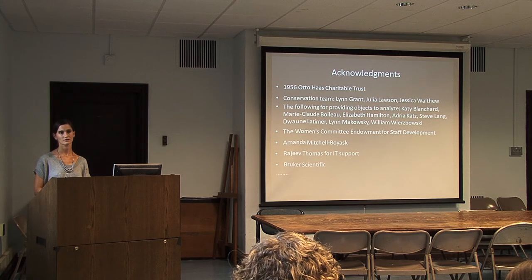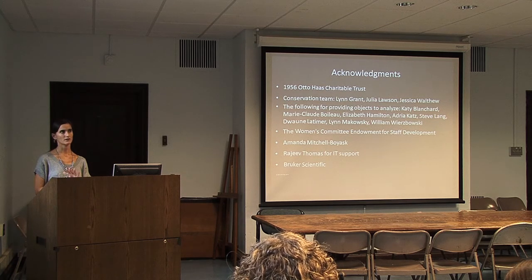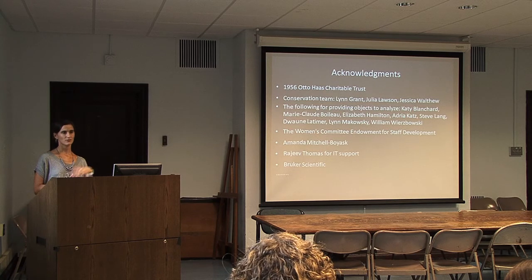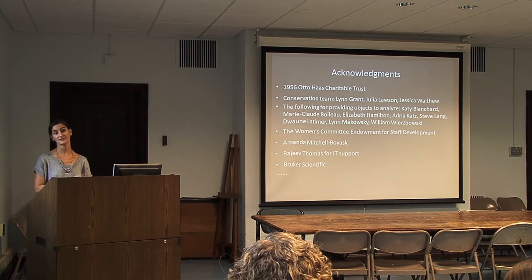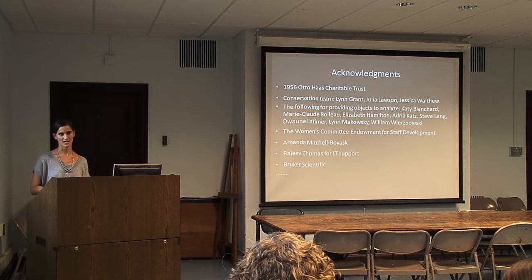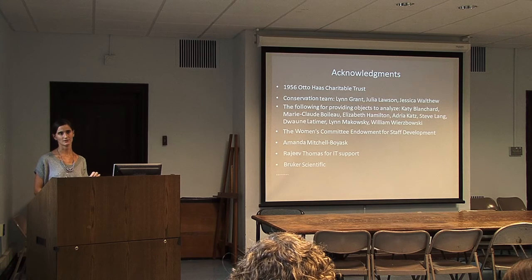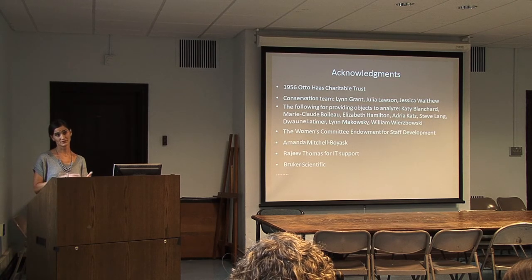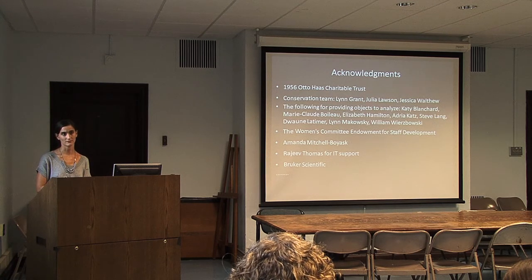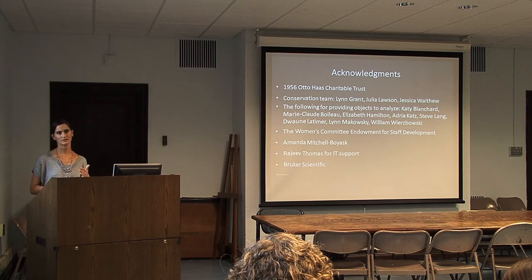Another question loosely related to the chromium issue: have you ever looked at ancient leather to try to see if there are tanning agents that you can spot? So I haven't done that yet. What I did do is I have a book with various leather samples. This piece is buffalo and it's native tanned. So I took that sample book and pulled out the samples that have any relationship to that, and I did blanks against that. And I took a background spectrum of just the unpainted area in the robe. Also, when I was looking at the other pigments, I didn't see chromium in any of those places, only in the yellow area. So it's a good question about what the tanning agents are, but we suspect that this is a brain-tanned robe, and that's consistent with known samples that we have.